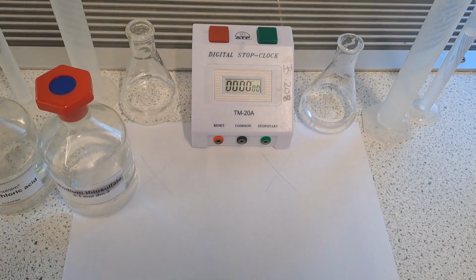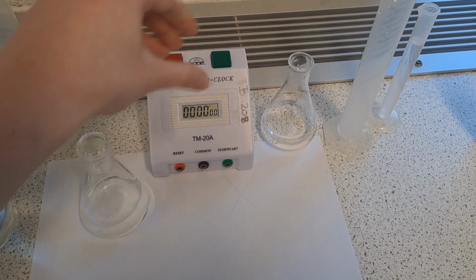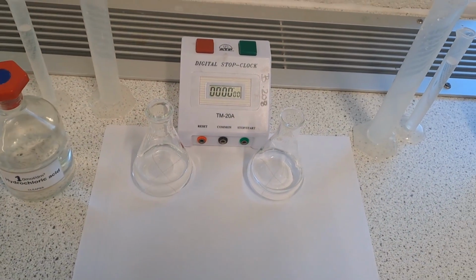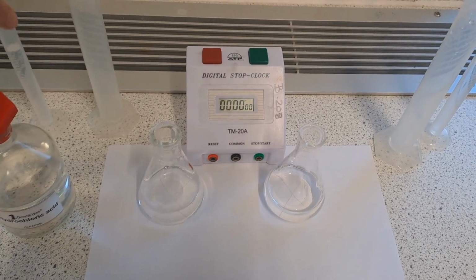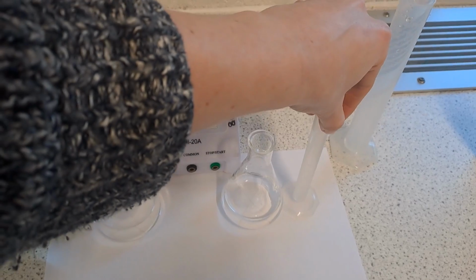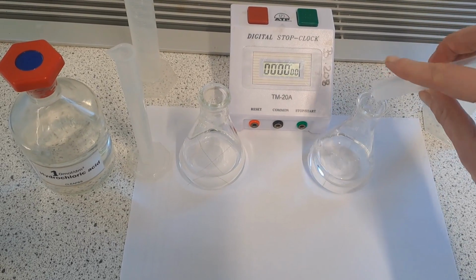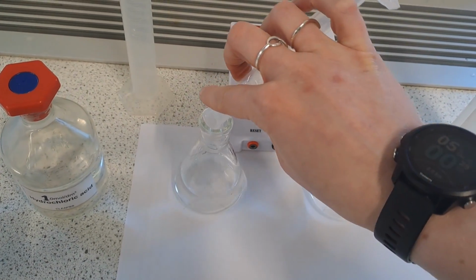But before I add that acid, I'm going to put both of these on a cross that I've drawn on a piece of paper. Now, in an ideal world, I would do them on the same cross, but here I'm trying to do them both at the same time just so that you can see the difference between them. So that sodium thiosulfate, either concentrated or dilute, is on that cross. And then what I'm going to try and do, more or less simultaneously with limited success, is add the acid to these and start the stop clock. So obviously I can't actually add them at exactly the same time, but you're going to get the general idea anyway.